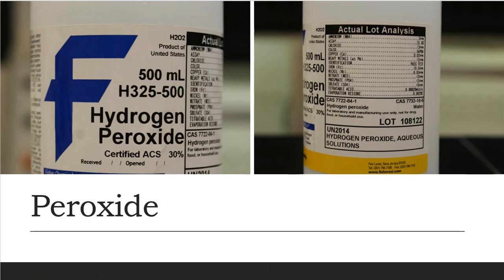All right, we also are going to have peroxide. Here's the peroxide bottle. This is 30%, folks. This is not your mama's or your papa's 3% that they would pour down your ears or make you gargle with in your mouth or put on your boo-boo at the house. This is 30%. This can make you go blind. It sucks all the moisture out of your skin. It can burn if you get it on you because it is ripping the moisture out. And then you will be left with a huge dry spot for maybe a day or two before you can replenish the moisture in your skin.